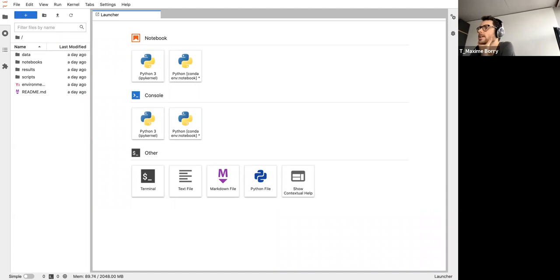How can you classify an ancient microbiome? Do you compare their sequences with modern ones? Question from Konstantinos. This is actually what we're going to do right now, what I was also introducing in the slides before. When you work with the ancient microbiome, you get your DNA, you sequence it, and then you compare this DNA to reference databases of reference genomes that contain the sequences of the genomes. Most or all of the genomes are from modern references, and then you look at which pieces correspond.